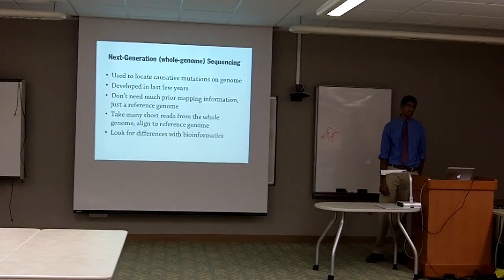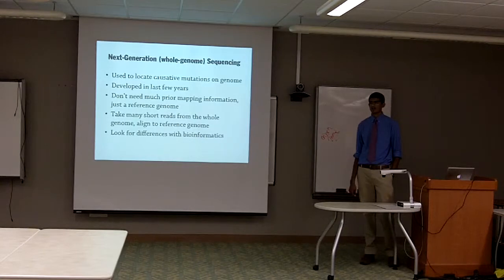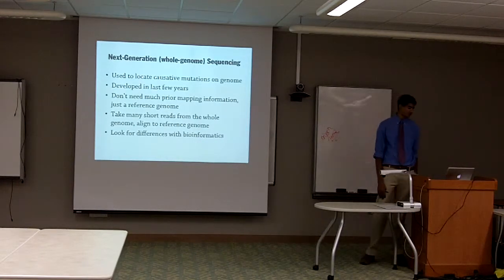So consequently, this can be applied to a broad number of different organisms. And the basic idea is you take a bunch of short reads from your subject population, and then you align these reads to the reference genome. Through doing that, you can then compare all your reads to the reference genome and see where the key difference is with your subject group.